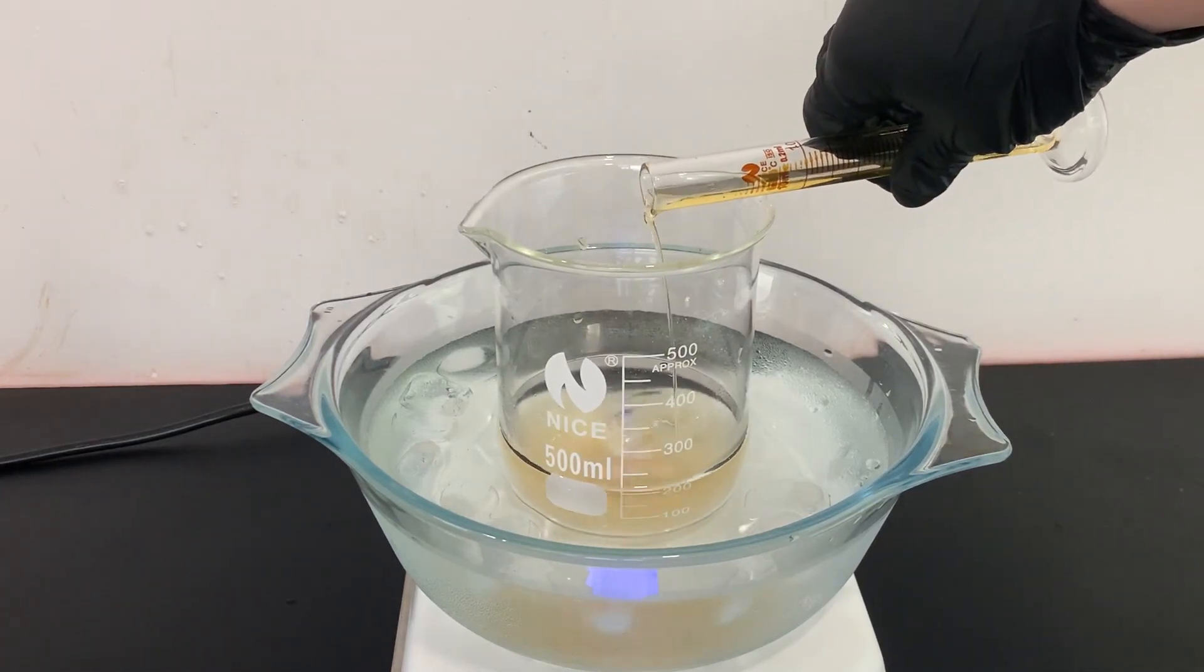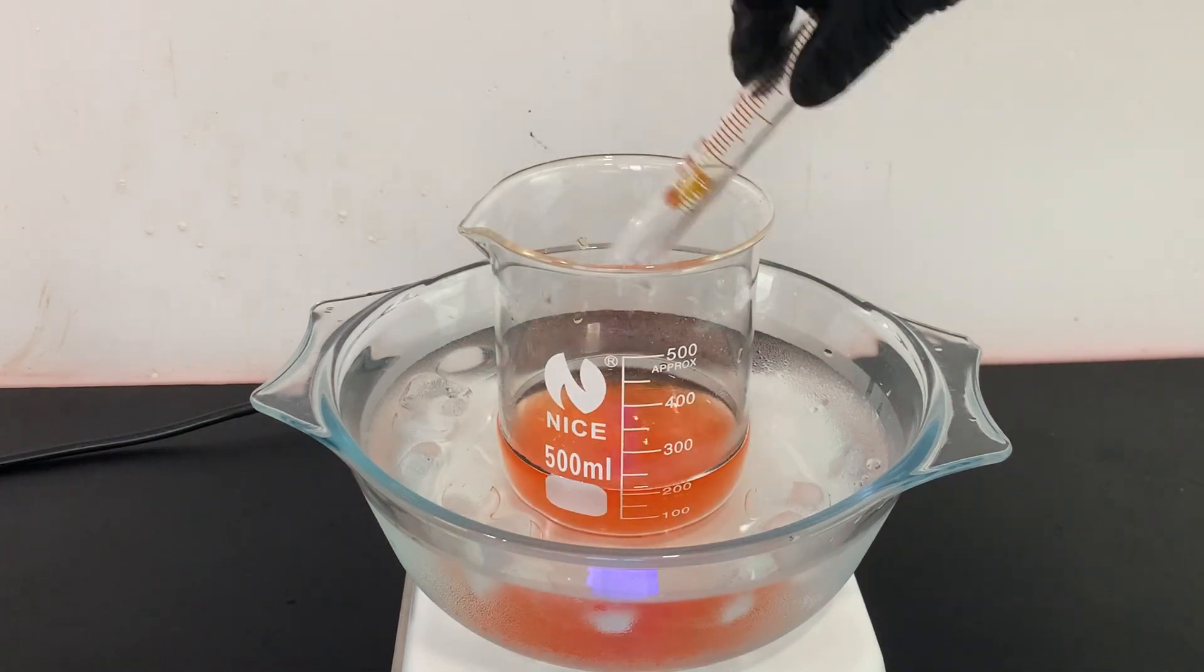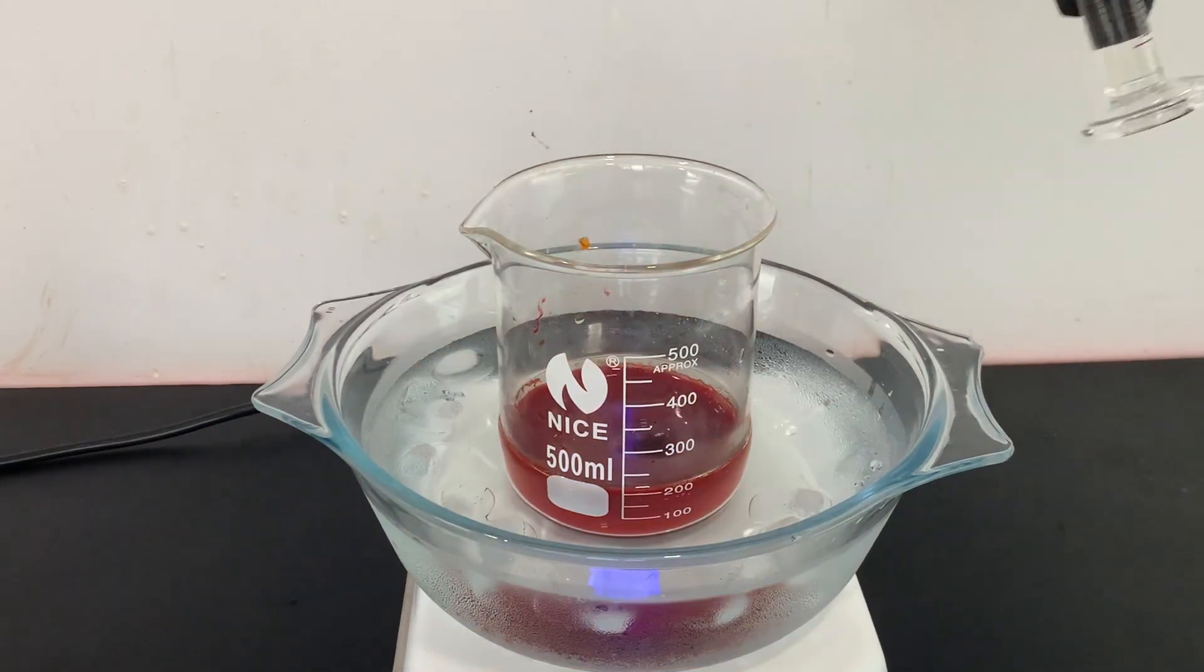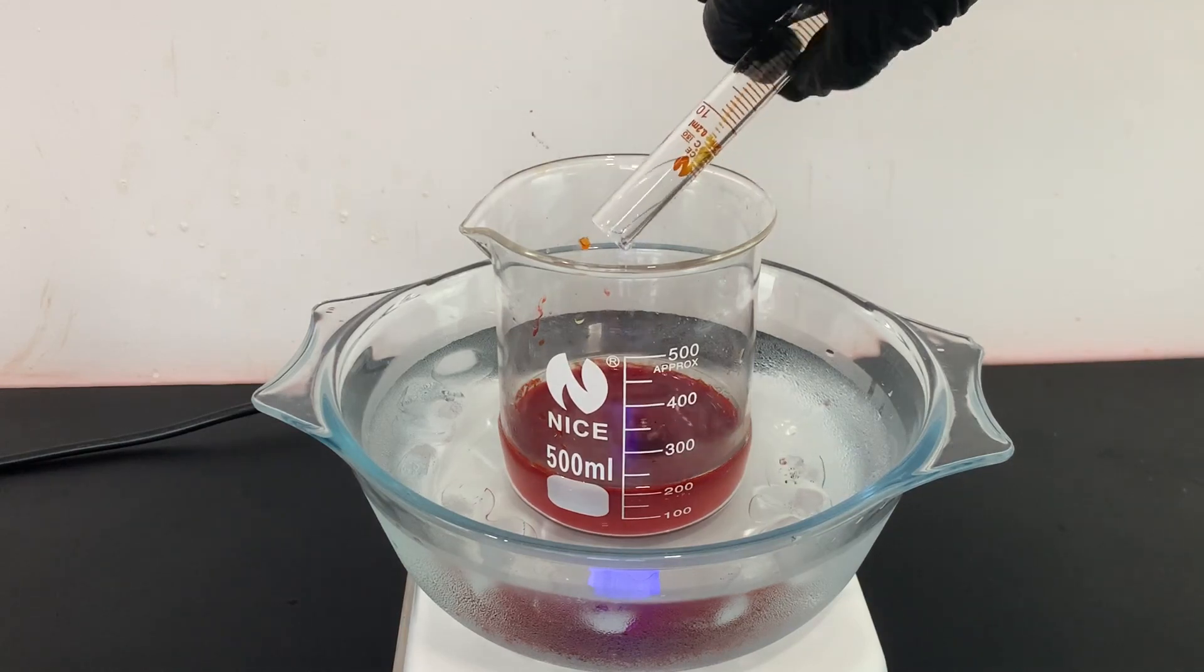I then added 2.8 milliliters of NN-dimethylaniline to the reaction mixture. A color change is immediately observed. I washed the measuring cylinder with 5 milliliters of glacial acetic acid.